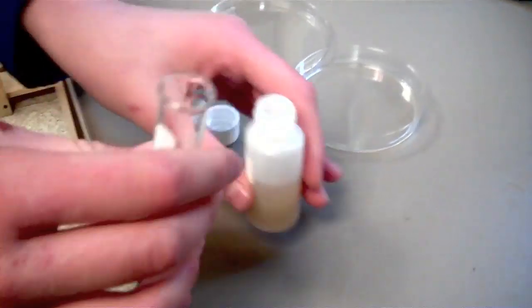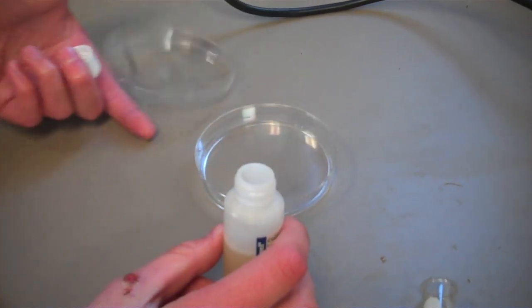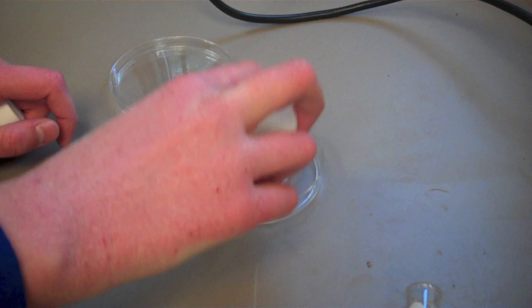Then mix the water with the Easy Gel. Shake the bottle for 30 seconds. After shaking, pour the contents of the bottle into a petri dish.